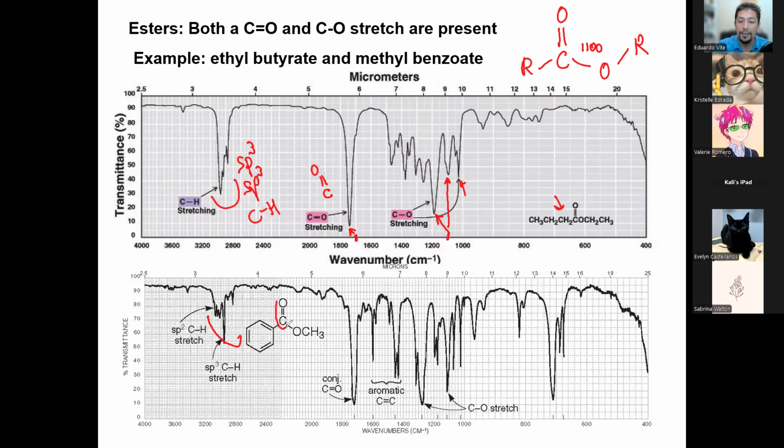There's a carbonyl right here. So let's go to 1700. 16, 17 is right here. Look at that, there is a peak right there at 1700. That is a carbonyl of an ester that is also conjugated. And then look over here, just like in our first example, we have very sharp peaks, characteristic of our carbon-carbon double bonds between 1400 and 1600. These are just kind of there; you don't really know what they are unless you know you have a ring and you're expecting them.